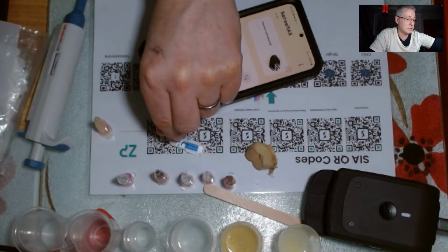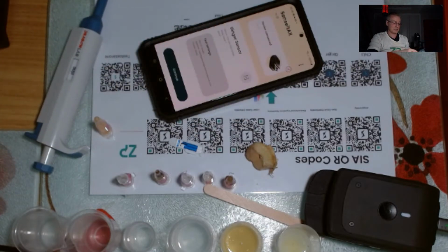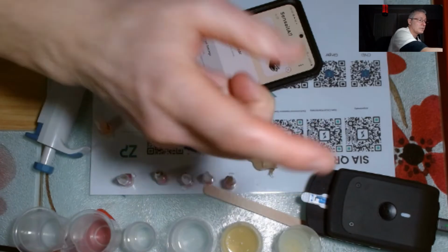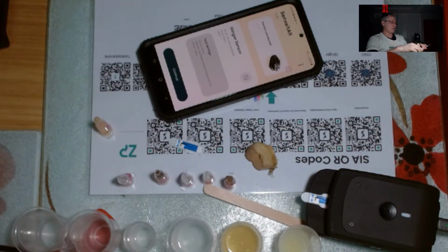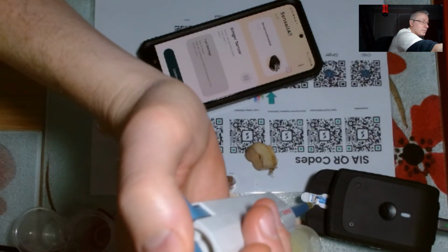There are some nice features about this. I might take a fresh sensor because I can't quite remember the history on that particular sensor. So let me take a fresh sensor. No alignment, just click it in like that. Super easy. Another benefit of electrochemistry is that we never need much sample. And also this sample is not transparent like an optical system would require.